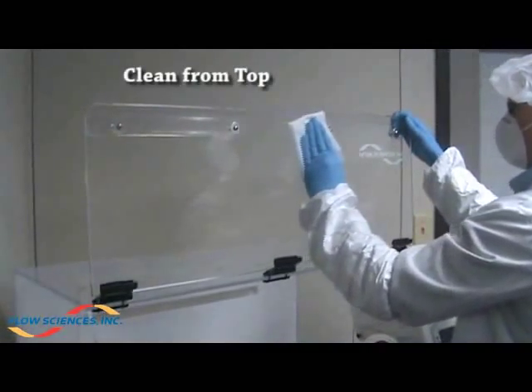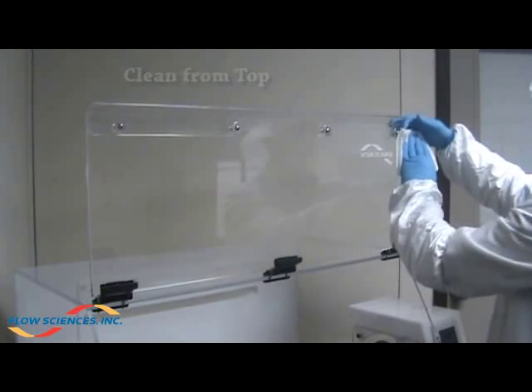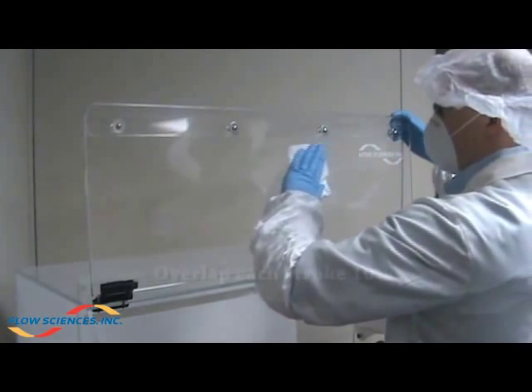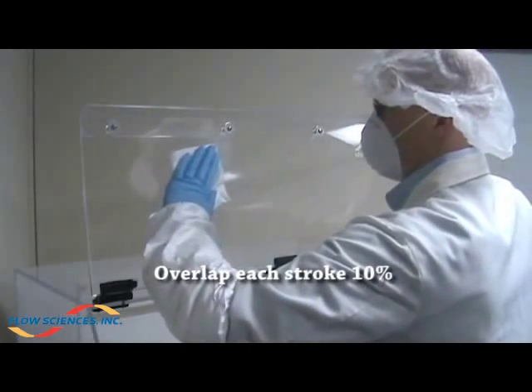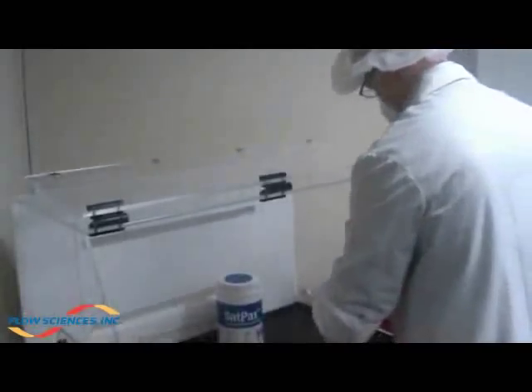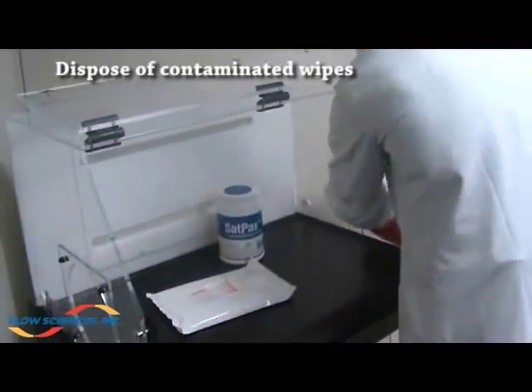To clean the interior of the front door, start at the highest point and work towards the bottom, overlapping each stroke. Dispose of contaminated wipes after using all eight sides of the wiper.